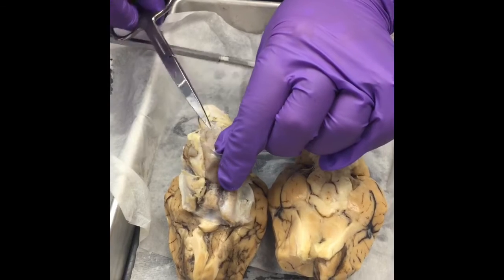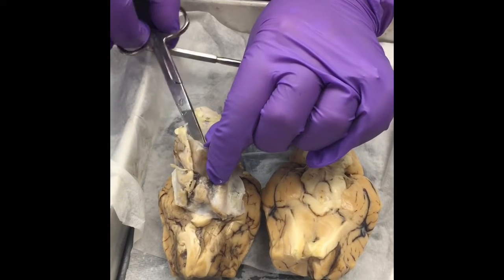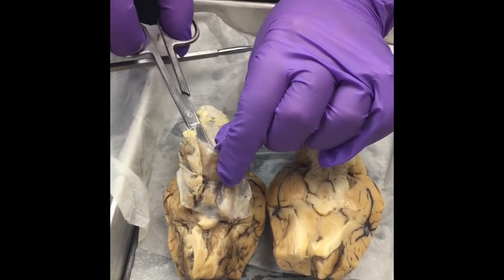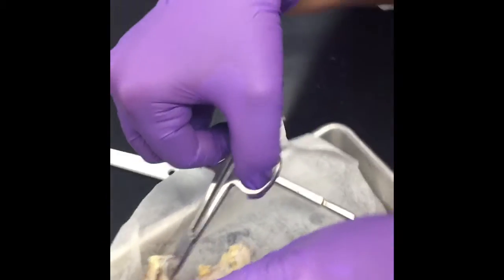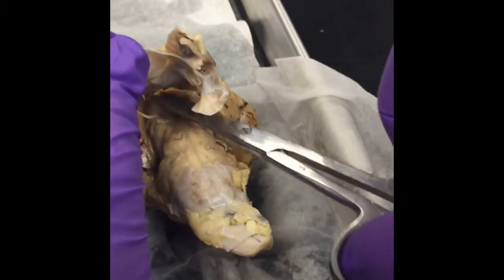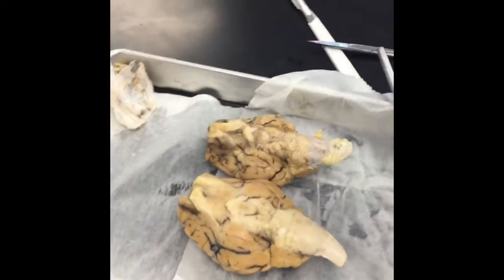Once you remove it, though, you're not going to see the pituitary gland again. And what I'm doing is, attached to the bottom here, there's lots of little nerves. So I'm cutting it in a way that leaves the nerves intact. Okay. We're just going to put that on the side. Just leave it over there.